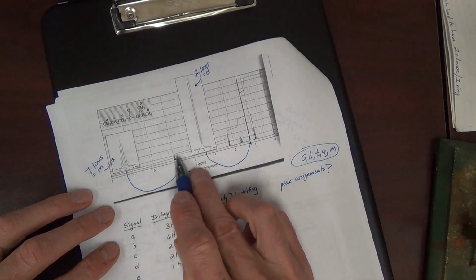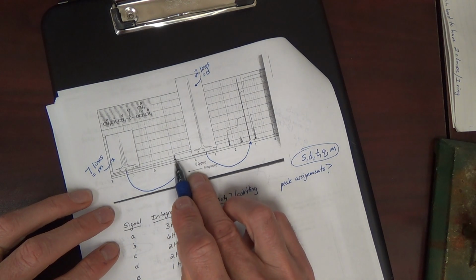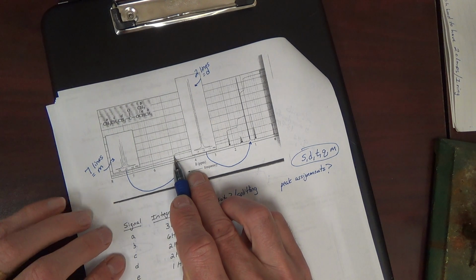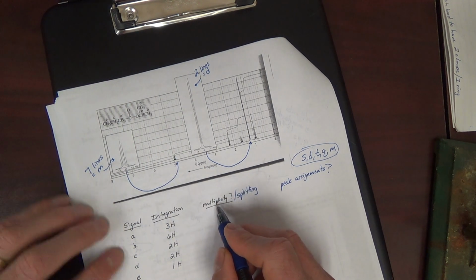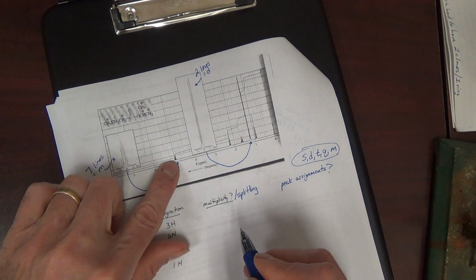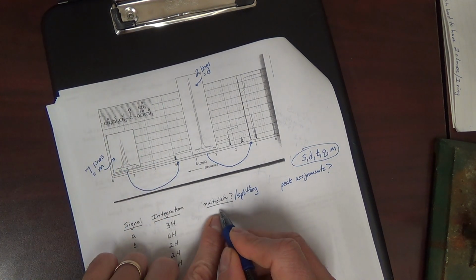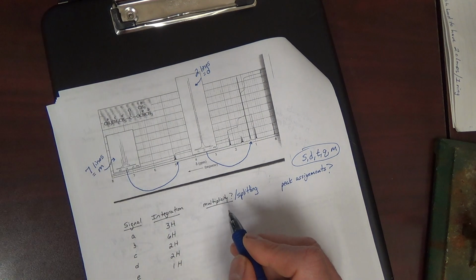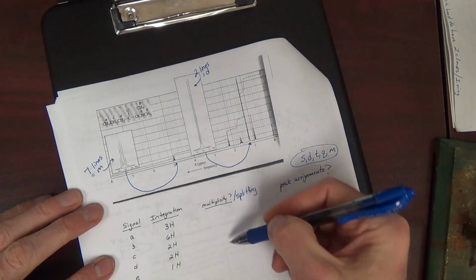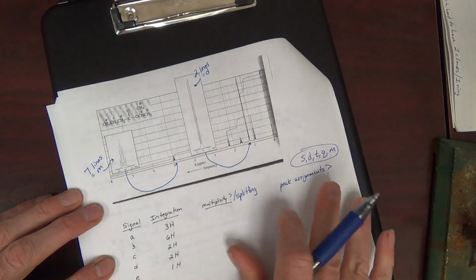Which signal is this? Is this A, B, C, D, or E? All right. And whichever letter it is, in the multiplicity we're just going to write M for multiplet. Okay? So if it's for A, we would just write multiplet here. But it's not A. Try to fill in the multiplicity that we see. We're not predicting multiplicity.